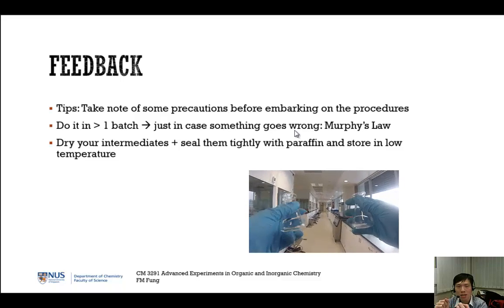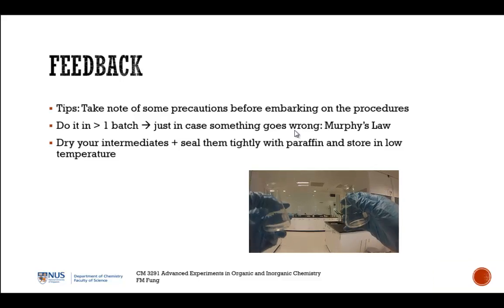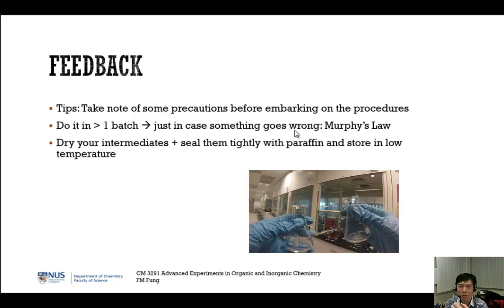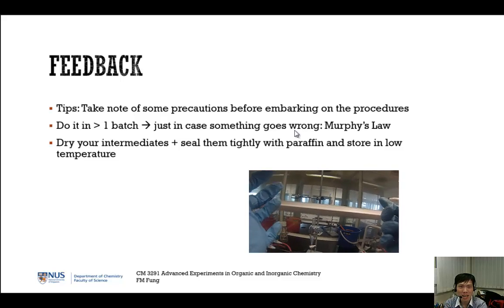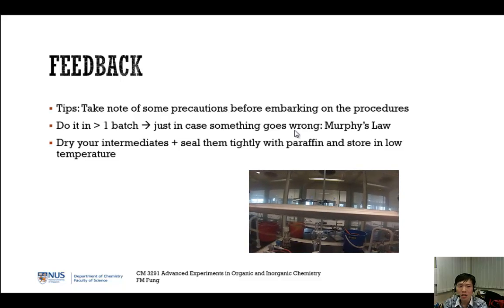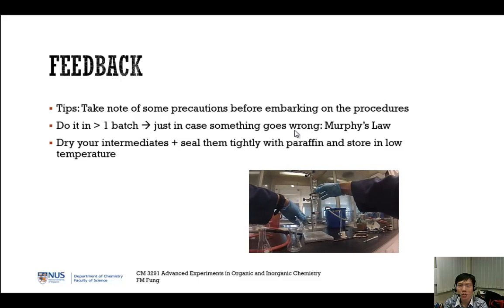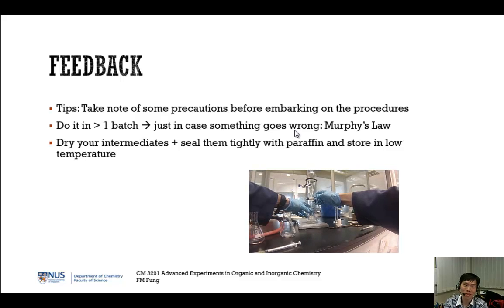Which means to say that the temperature, if you heat it up the same as in the part where you don't scale up, your reaction may go what we call a runaway reaction. That means it's too vigorous, too much heat is generated, and it could get explosive and you can't really control it. So that's why, to be very safe, please follow the experimental procedure.